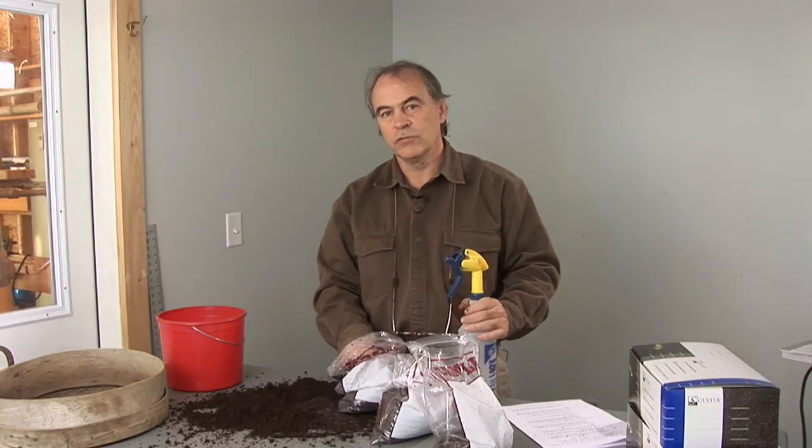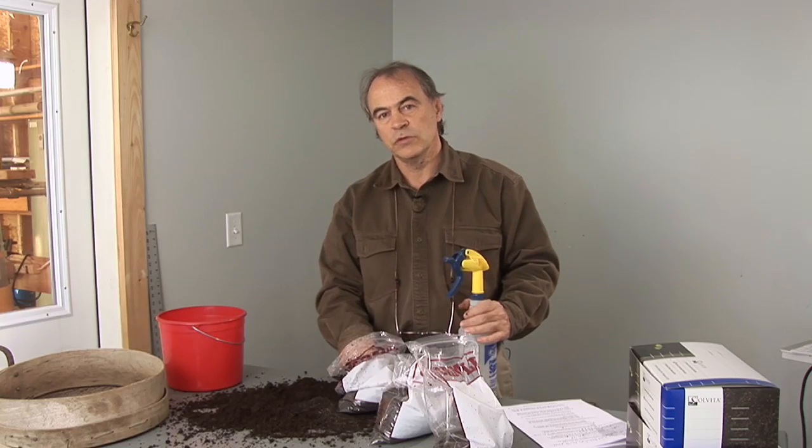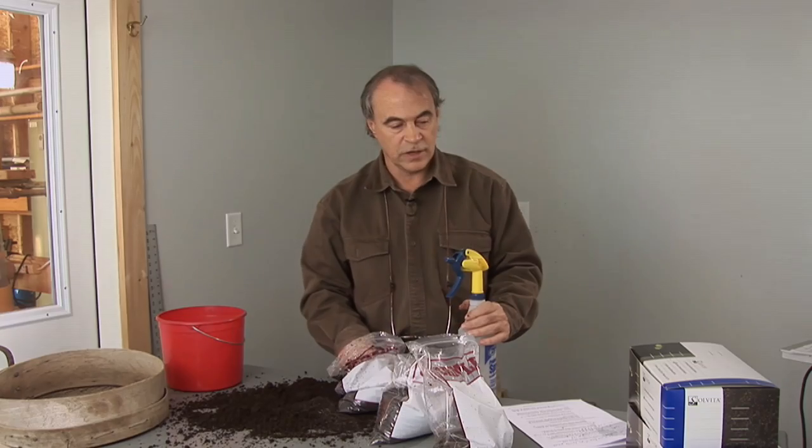Now that we have ready, screened compost of optimal moisture level, let's perform the Solvita test.